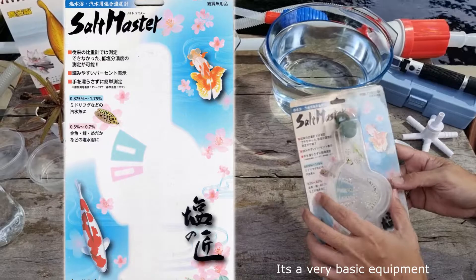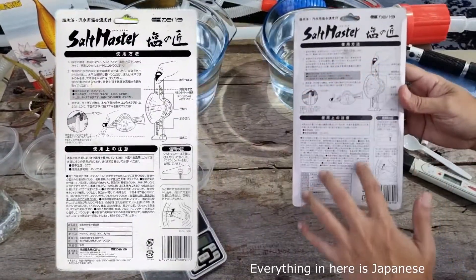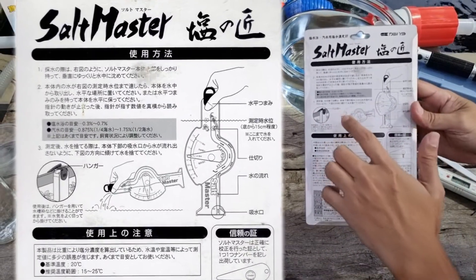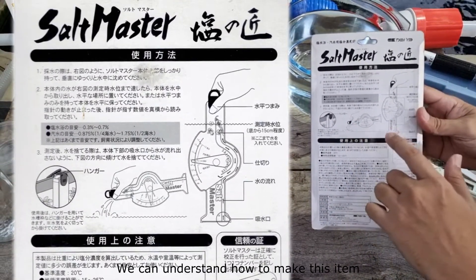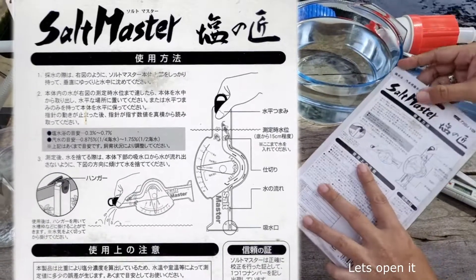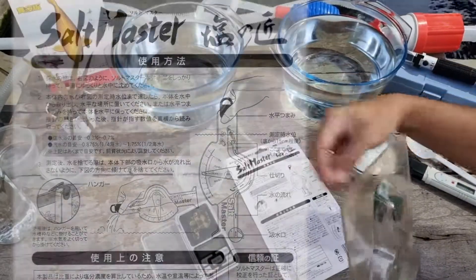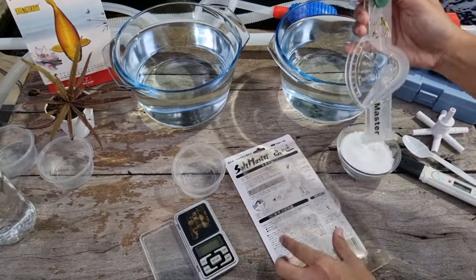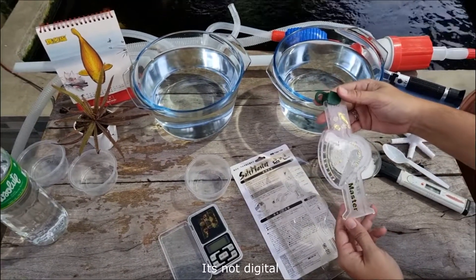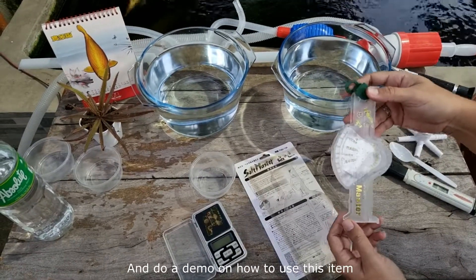It's very basic equipment. Everything in the packaging is in Japanese, but from the illustrations we can understand how to use this item. It's analog, not digital — let's dive straight into the demo.